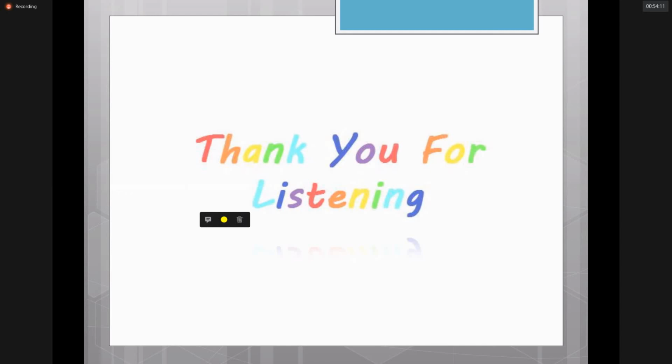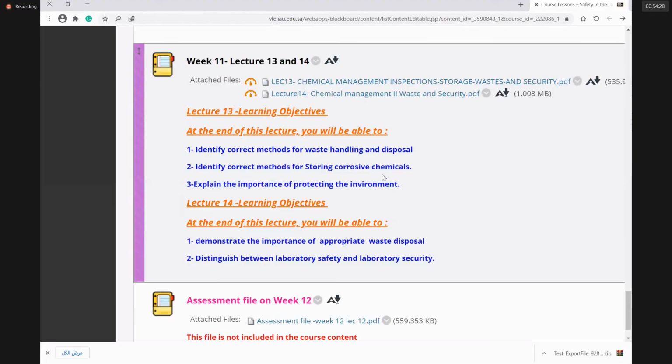So thank you for your listening. We reached the end of our lecture today. تحدثنا اليوم عن chemical management. We talked about how we can store a corrosive chemical in its cabinet, the special cabinet for the flammable and corrosive.